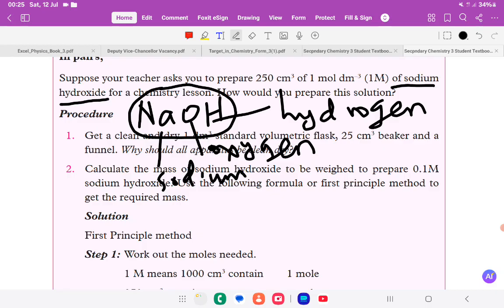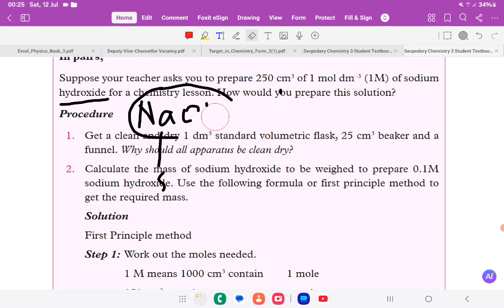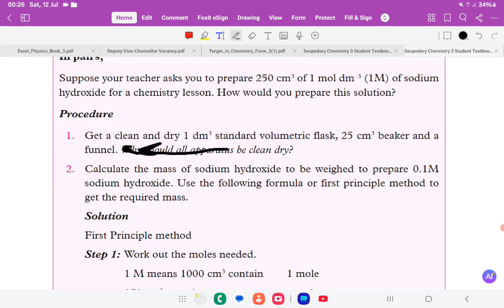All right, so instruction number 2. Remember that these are the things you need to write down if you are asked to explain how you can prepare a standard solution whose concentration is known accurately. These are the things you need to write in an exam. Of course, you don't ask this question here to the examiners. So you go as far as that point.